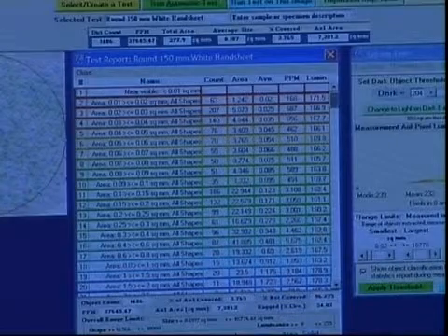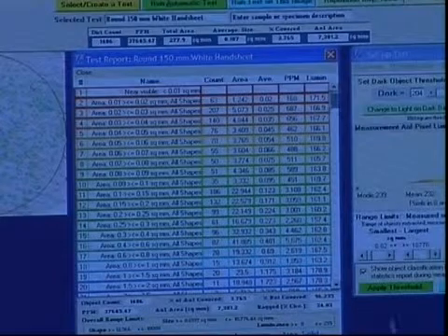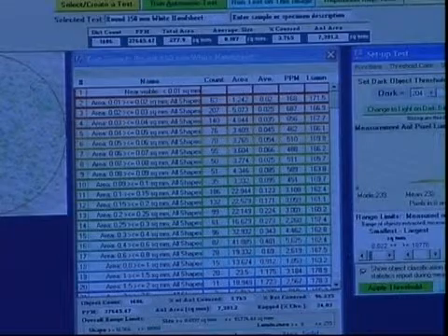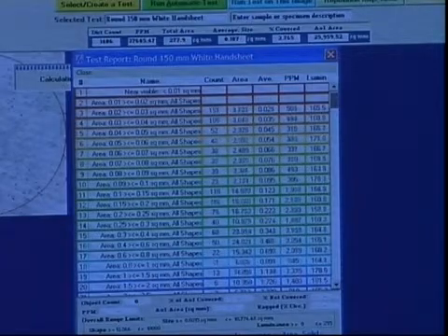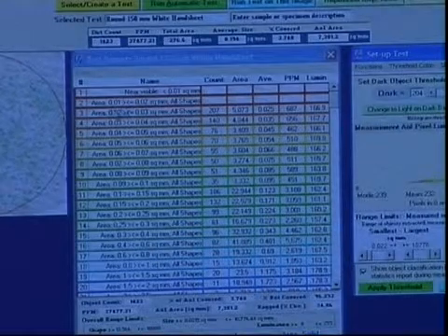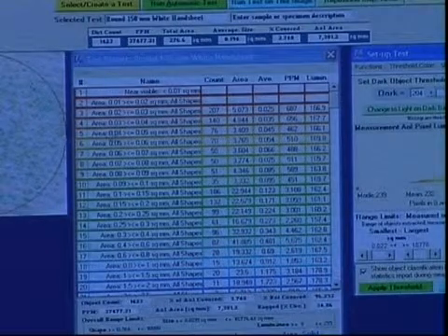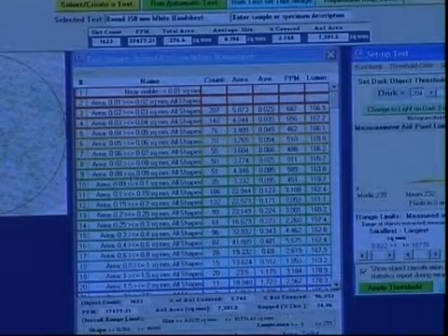Each one of the specs is classified into categories. We have 207 at 0.02 and above, even though we filtered out because we got rounding errors in there. Let me set that at 0.02 and we'll do it again. Yeah, now we don't have the rounding errors. You can see this is 0.01, 0.02 to 0.03, and so on down the line.